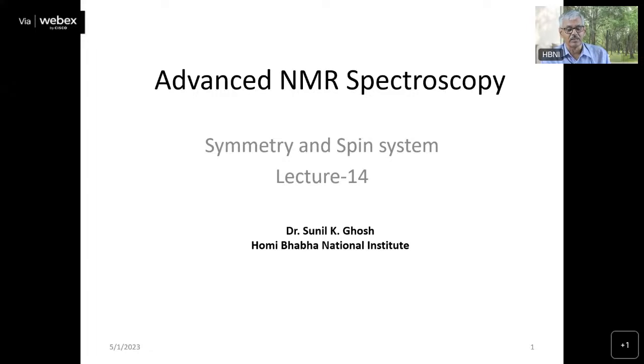So today I'll continue with the application of NMR spectroscopy, specifically for organic molecules. Okay, so I'll first do a little bit of revision and then we'll go into the problems. First I will discuss symmetry and spin system, because this is very essential to understand in order to analyze the spectra. Although I have told you in my earlier classes about symmetry and spin system, I will still go over some of them and also give additional examples.